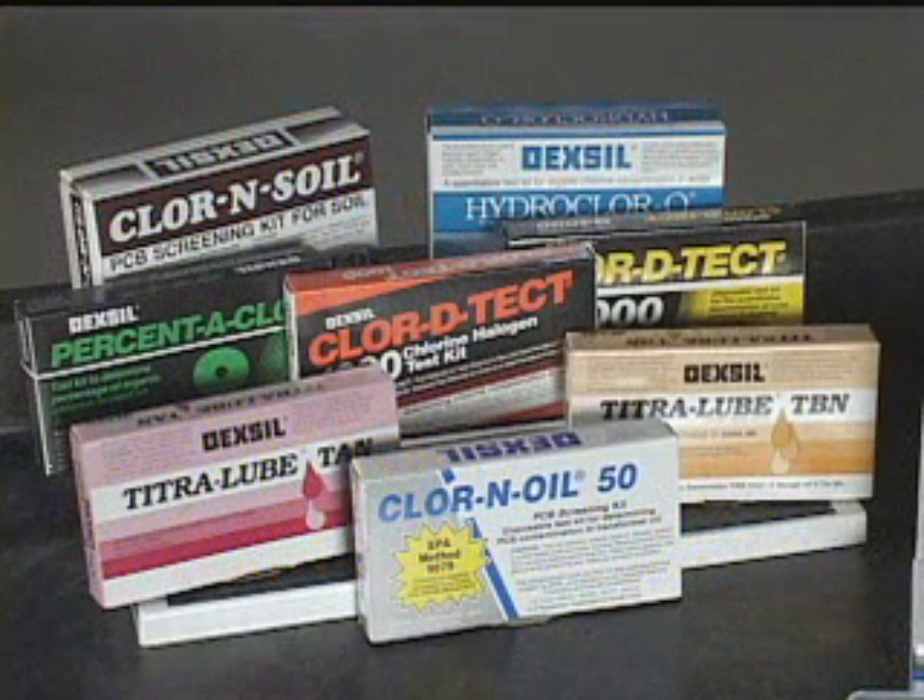This technical hint pertains to the following products: Chlorin Oil, Chlorin Soil, ChlorDetect, Hydrochlor-Q, Procentochlor, Titrolube TAN, and TBN.